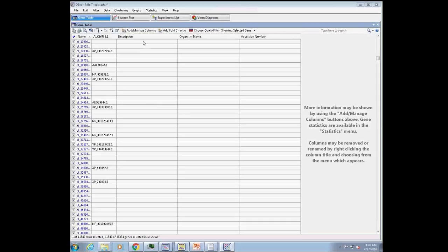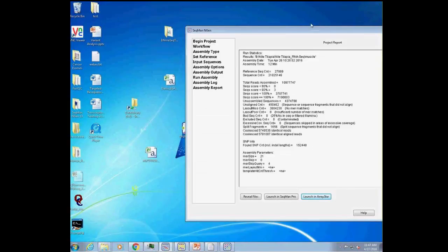Okay. Well, I think we covered quite a bit here. I'm sure there'll be plenty of questions. There are all different variations on this workflow.